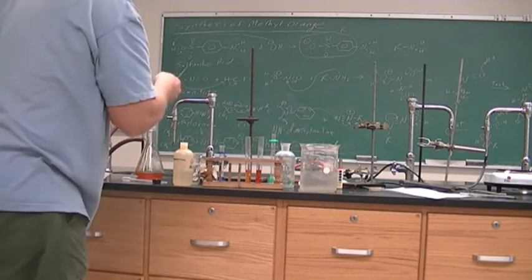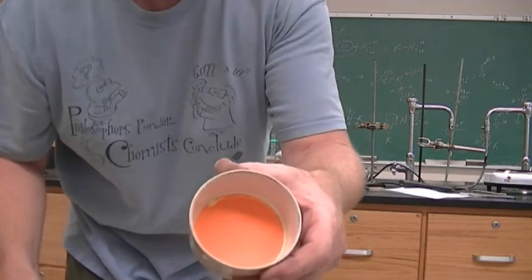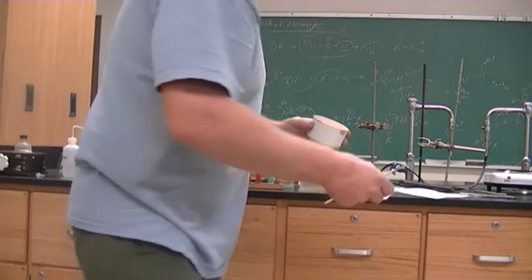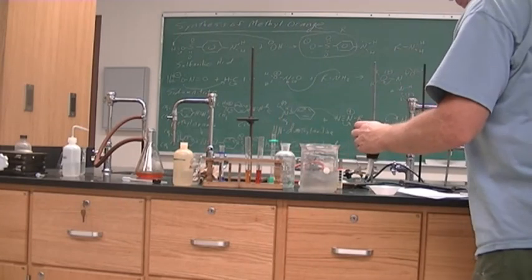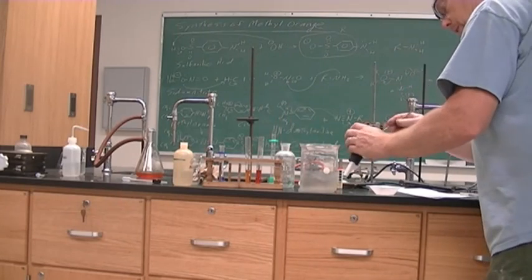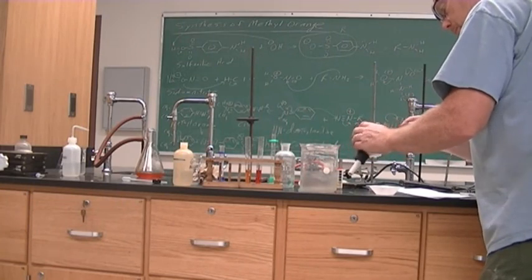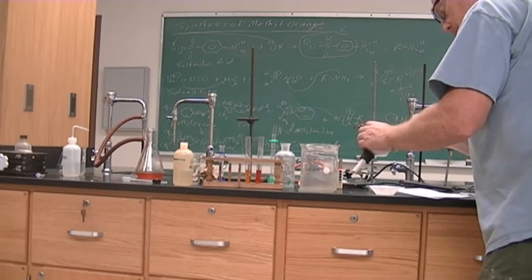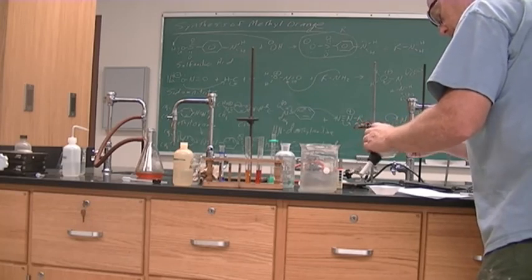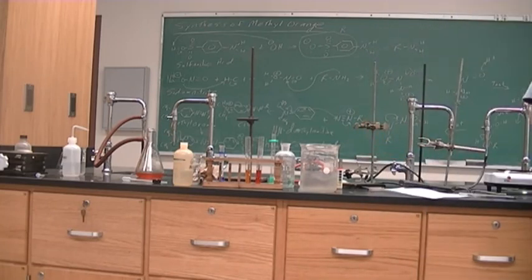All right. So forming good suction. So you see the product is an orange solid. And it might still be kind of wet. So get mass. And that's all we need.